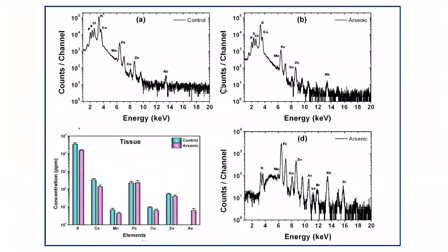So this is what they did: they had the control sample. When they had their sample under study, they found there were certain other elements. It is possible to enhance the presence of certain elements. If you see this, these elements are very weakly seen. There are tricks in the trade where I can enhance their selection and identify them. You would put your money and bet whether this is a peak or not a peak. But when I show you this, you would definitely agree that yes, there is a peak corresponding to rubidium and zirconium. So these are the instrumentation or experimental tricks we use to enhance our sensitivity and selectivity.